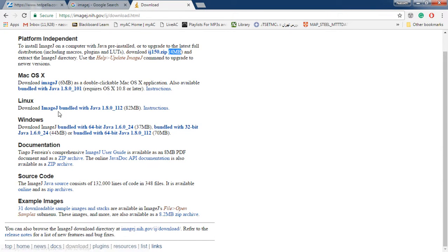Okay, if you are on Linux, which by the way Linux is awesome, download this one. It comes with a bundled Java virtual machine. It works fine. On Mac OS, I'm not an expert, but I'm pretty sure it's not going to be that difficult or different than Linux. It should be very easy. Download either one of these files and install it.